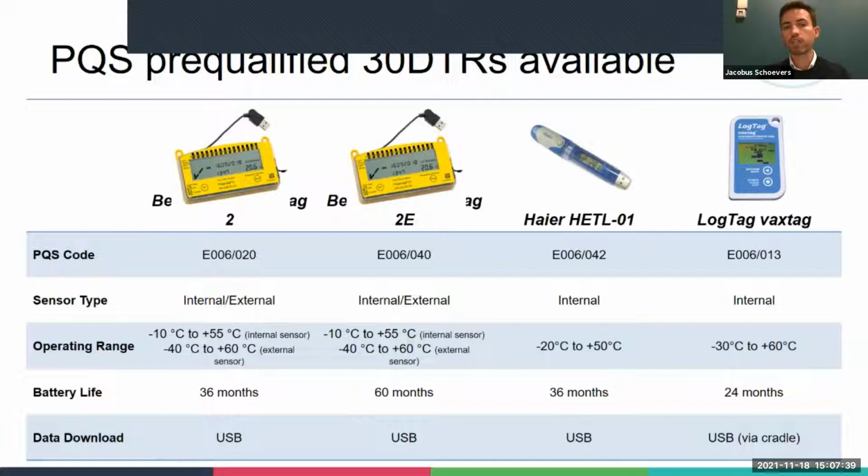But just to bring us back to the point that I made earlier, the devices are pre-configured with settings specifically for vaccine refrigerators, so 2 to 8 degrees Celsius. So even though the operating range is very wide, these devices are supplied pre-configured specifically for vaccine refrigerators.